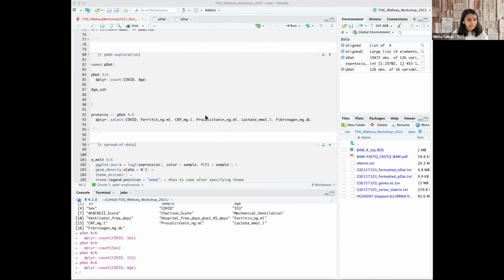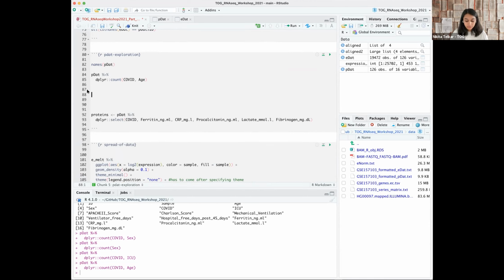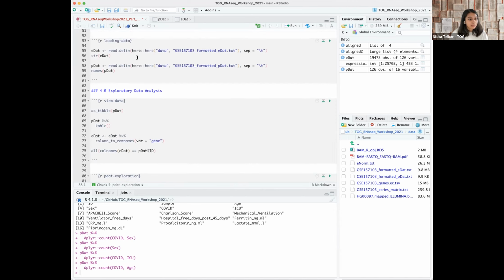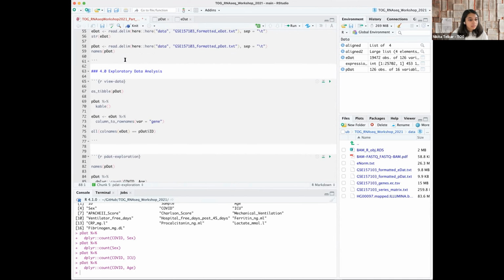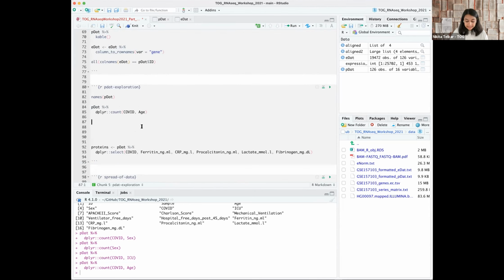Okay, I'm going to start writing the code here. Okay, age category, right? So what we're gonna do is, like I did before for our Pdot data frame, I'm going to modify the pre-existing Pdot data frame, okay?